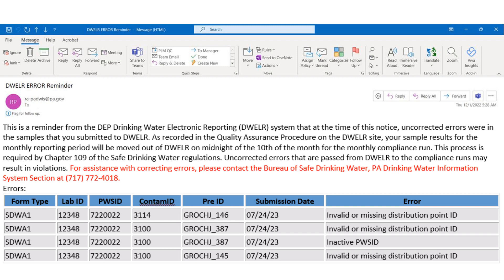For this example on screen, we can see that the distribution point ID was missing or is invalid and that the PWS ID is inactive. If you receive an email from DWELLR identifying errors, you should always go into DWELLR and check the error report and fix any errors before midnight on the 10th of the month.